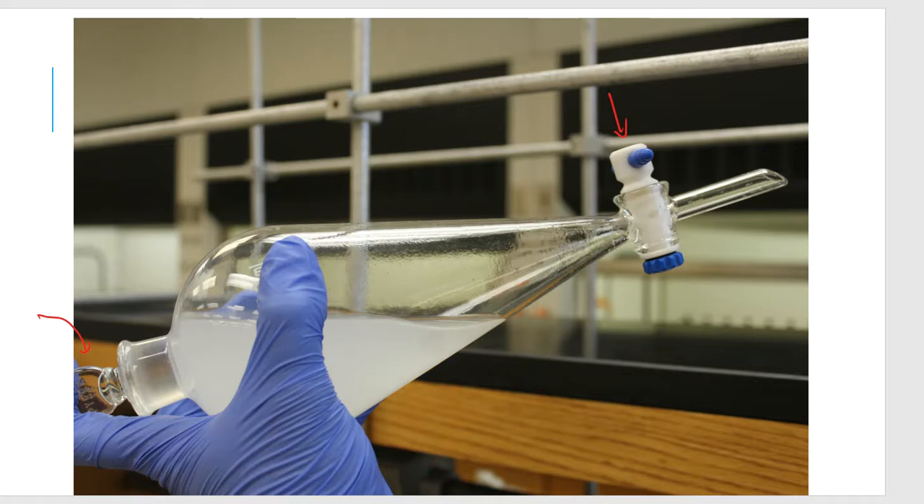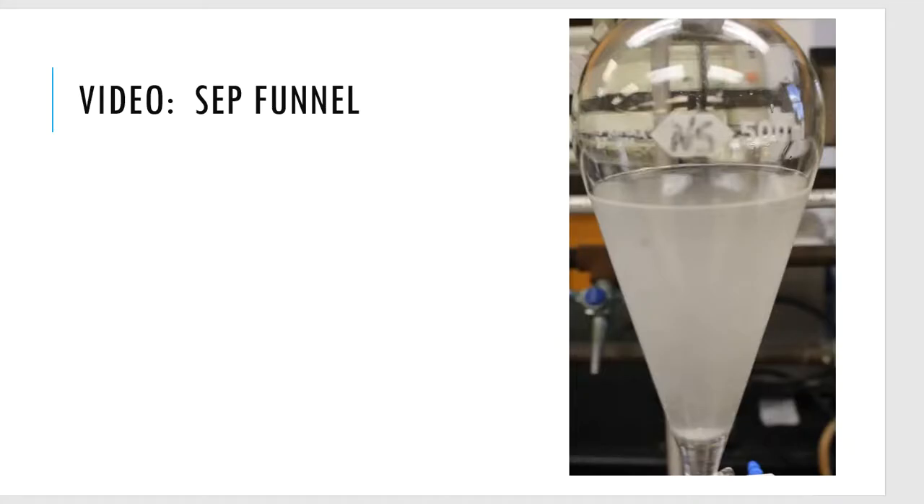I'll roll it, rock it, open it to vent it, close it back — roll, rock, vent, close. Then I put it onto the holder on the ring stand and allow it to separate. Here's a video of that process showing the methylene chloride addition to the separatory funnel. That cloudy layer is the water with a bit of clove oil to extract, and the small clear portion settling at the bottom is my first addition of methylene chloride.